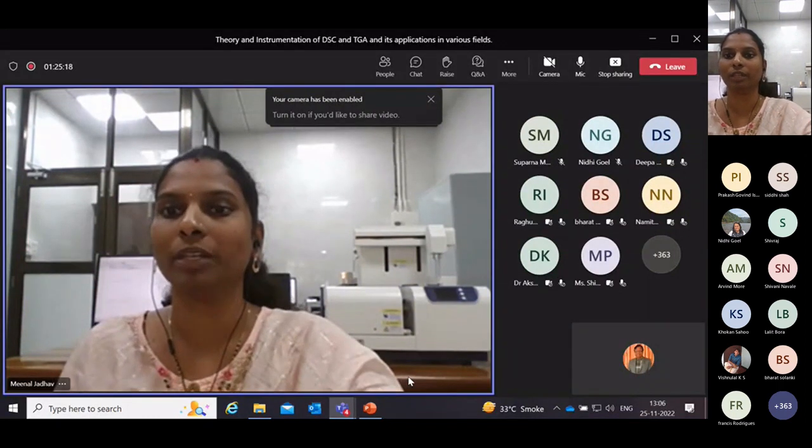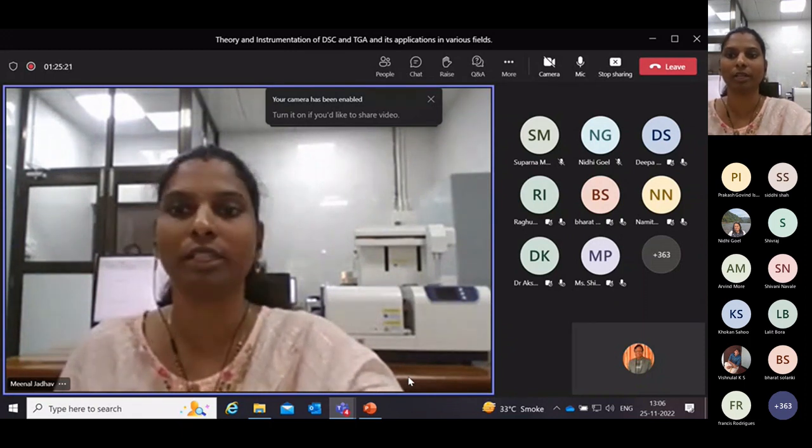How is the long-term stability of an emulsion or nano fluids determined using DSC?